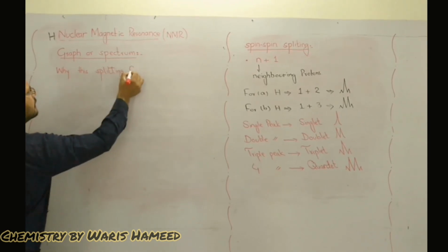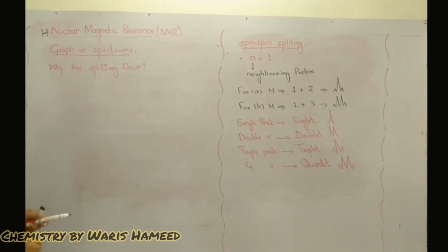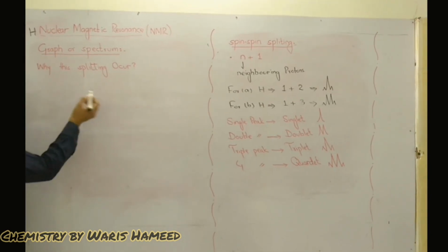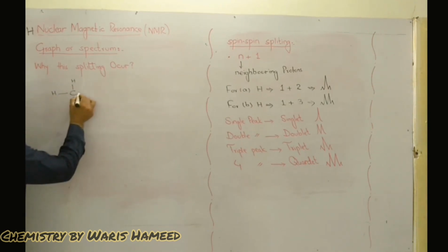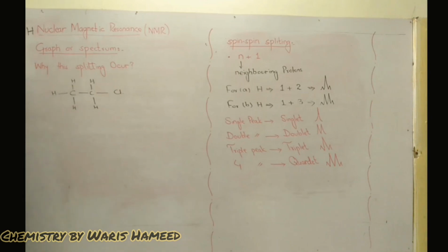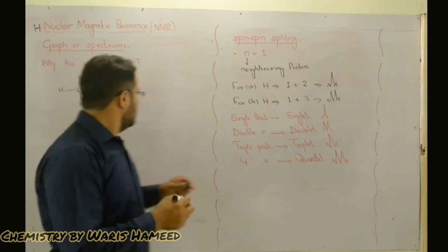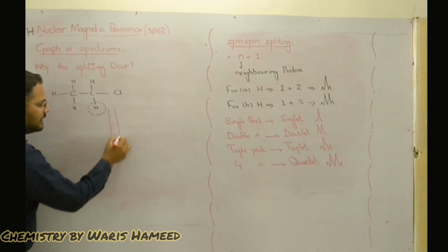Keep in mind that we have the same molecule as I wrote earlier. Just try to understand it. This proton has a field around itself, and we are applying the external magnetic field on it.